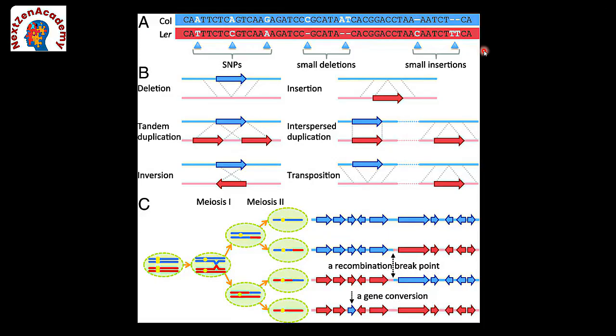But non-frameshift indels means changes in multiples of three. You can see the reference, and the red one is the sample of our interest, with variation in the genome.